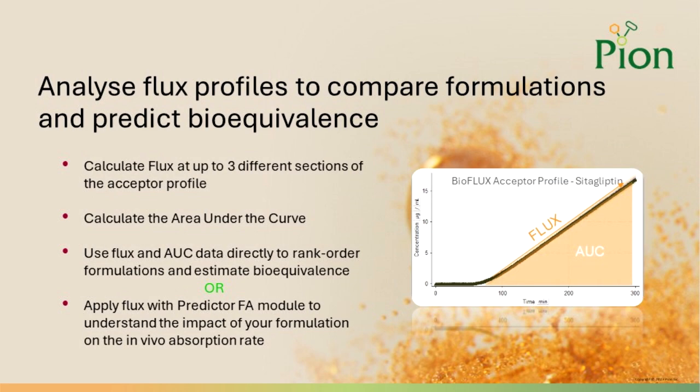The Predictor data module allows rapid flux profile analysis for the direct rank order comparison of formulation performance. Up to three different time ranges can be selected to analyze different sections of the acceptor profile. Use flux and area under the curve data directly to rank order formulations and estimate bioequivalence.